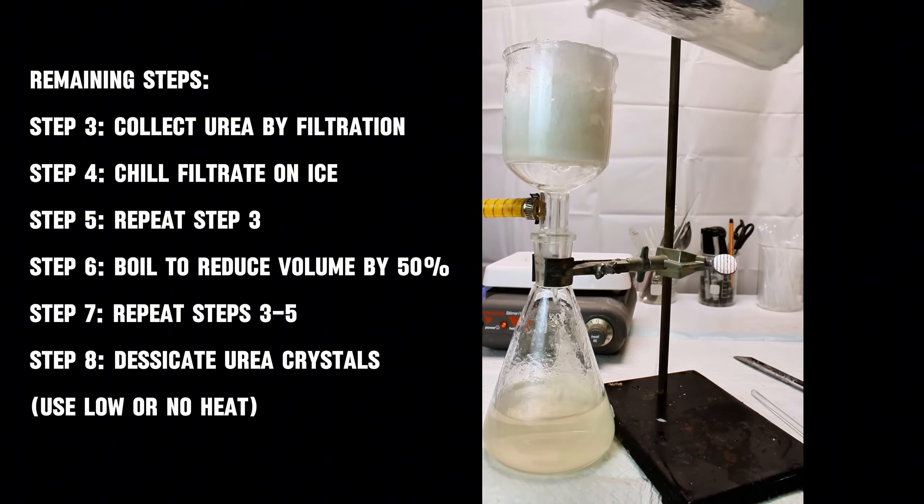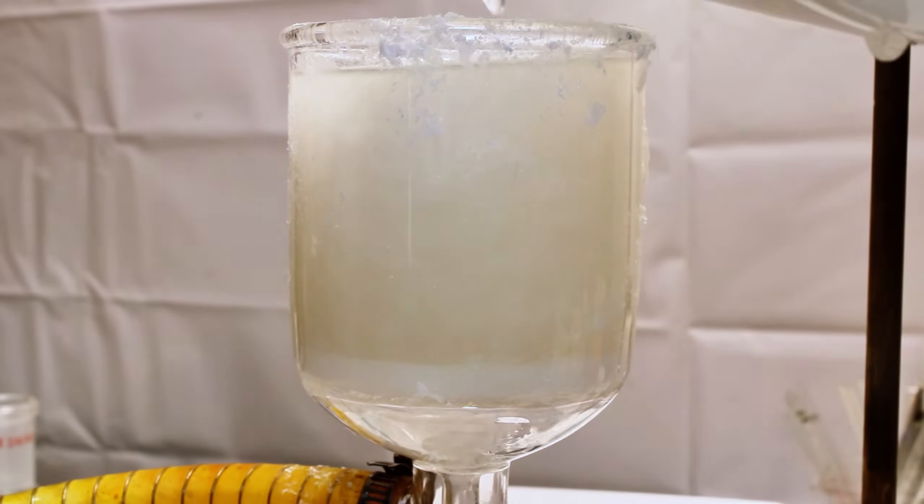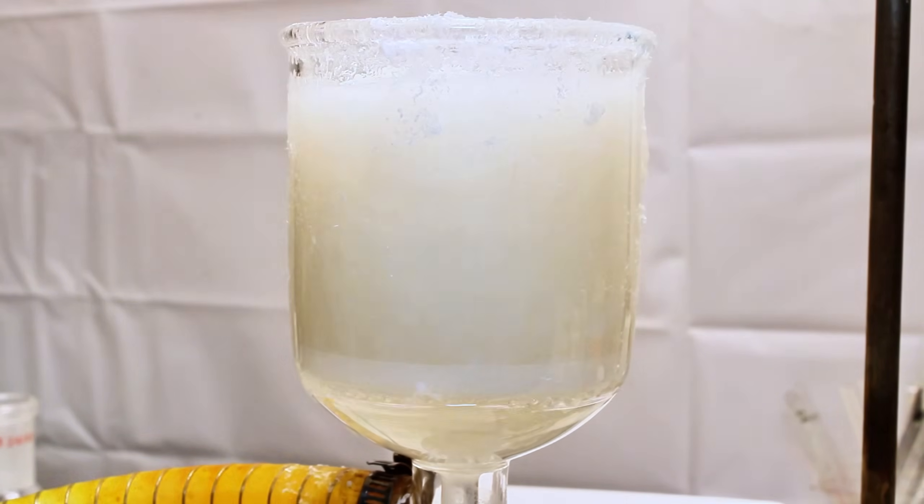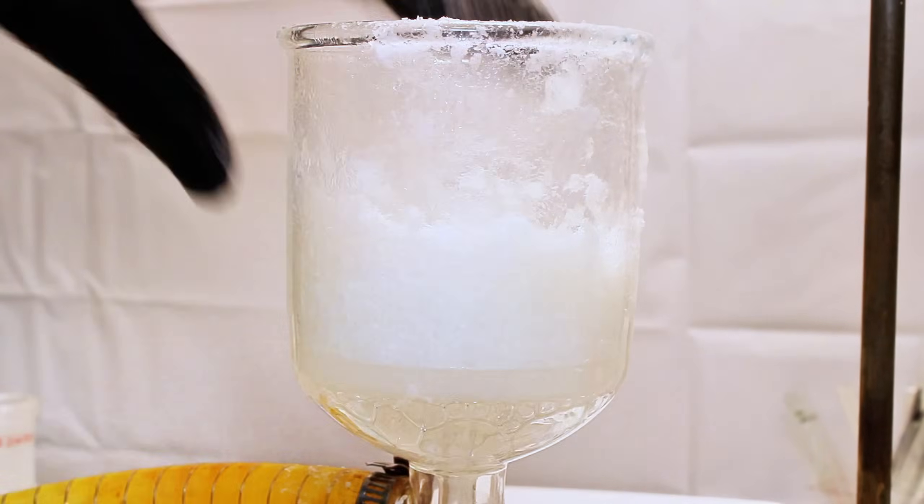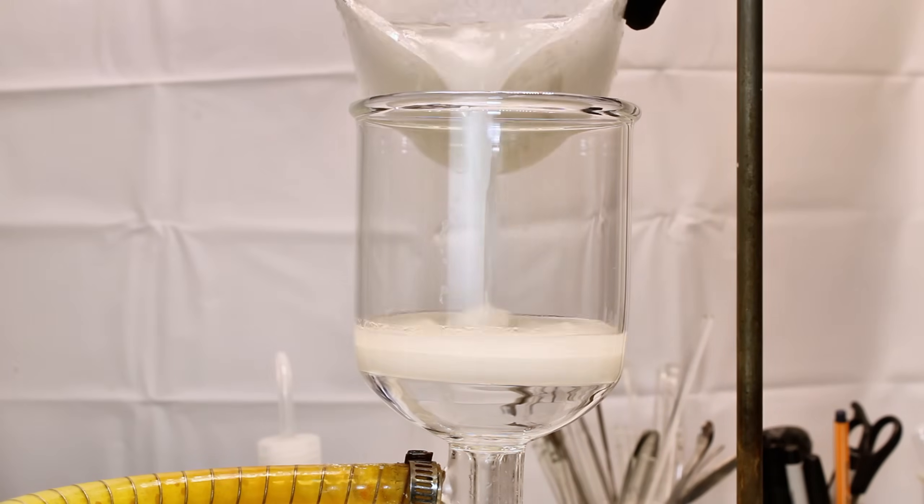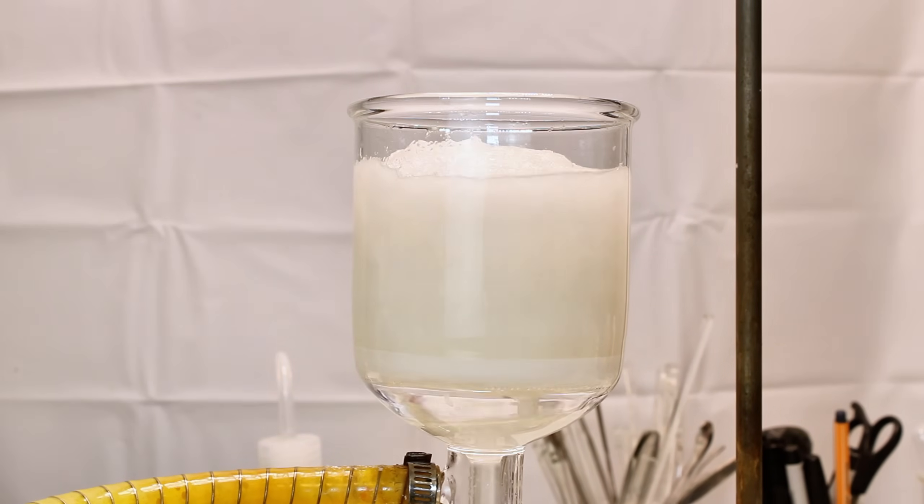The resulting filtrate is next cooled to near freezing and the process is repeated. To get as much urea as possible, I then boiled this second filtrate down to around half of its initial volume and repeated the above recrystallizations.